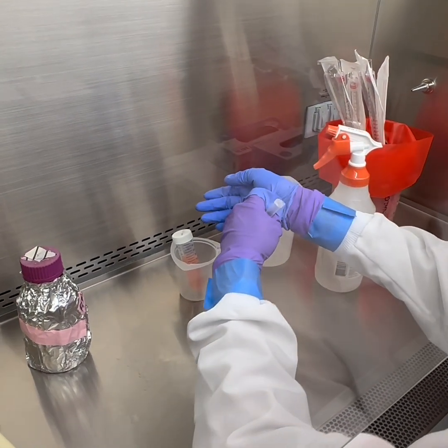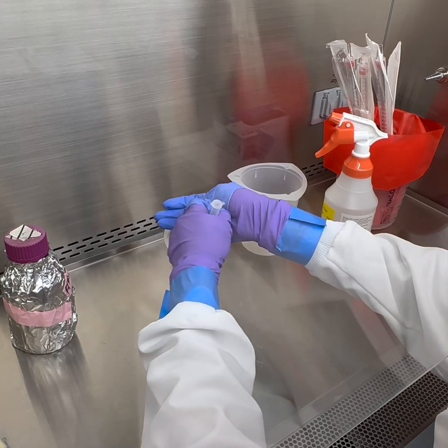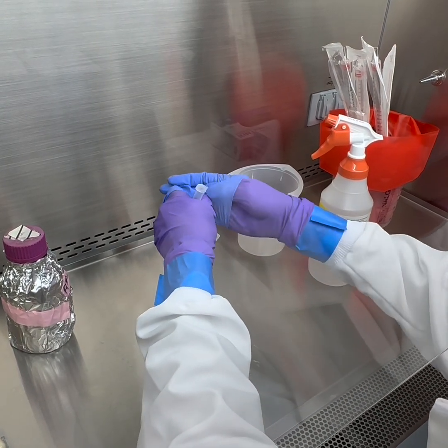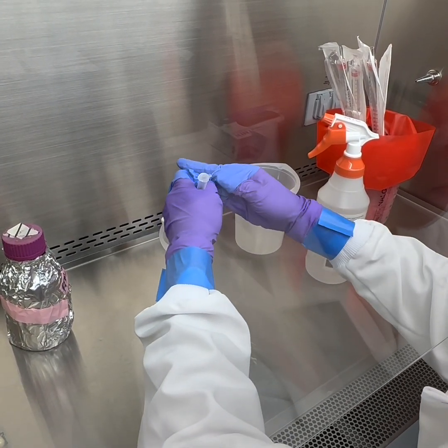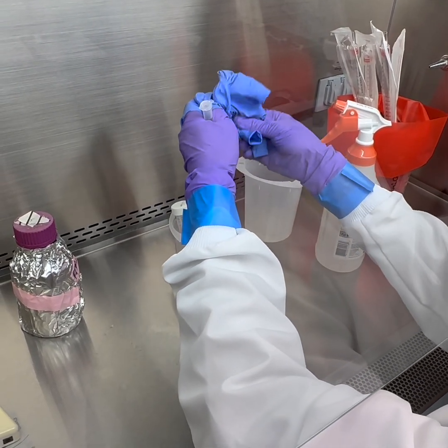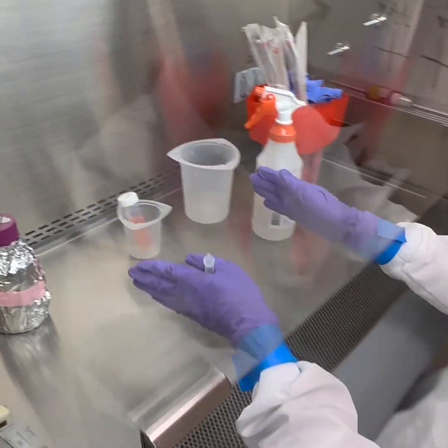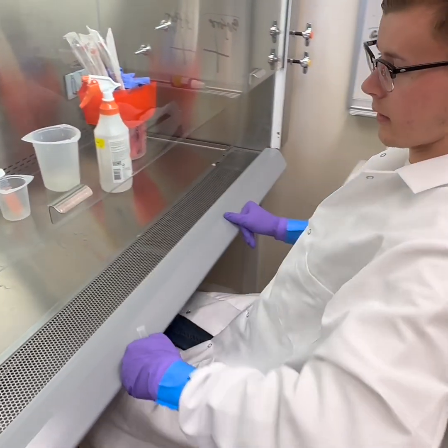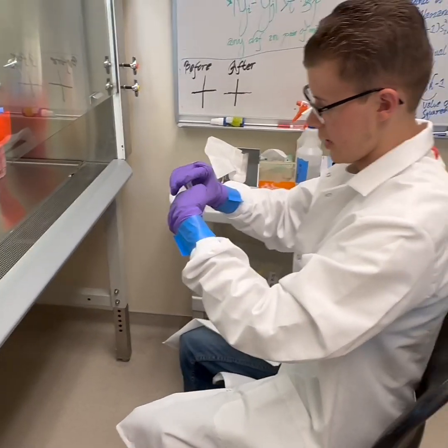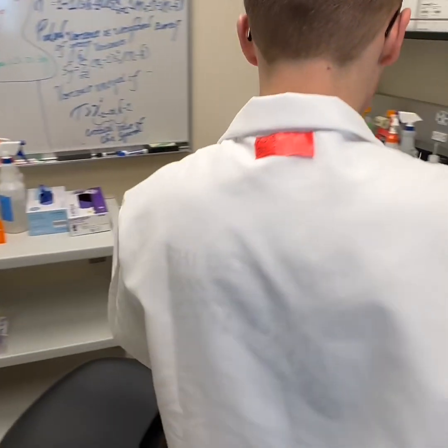It's a little challenging. All right, coming out of the hood. All right, now we will make our dilution to count.